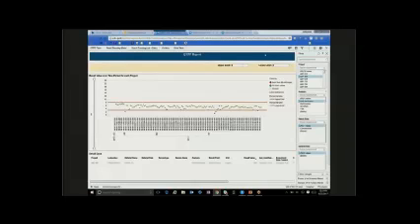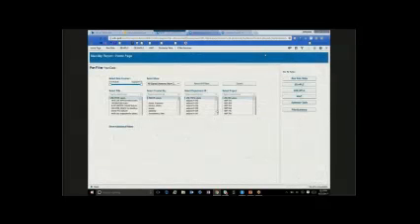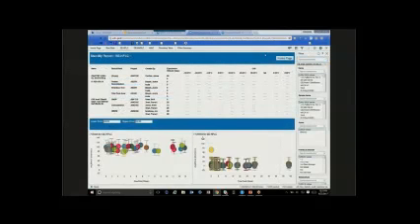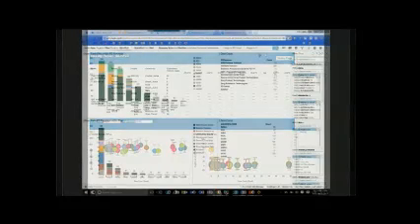So you can see, you can pick the project you care about and then search on that and find that this is the stability for biologics measurement. You're looking for the stability measurement of the aggregation of proteins. You can easily see now across the time course how the stability, the aggregation, is changing. Again, all in the data lake. By applying the right selection, query and filters, you'll find your data very quickly.